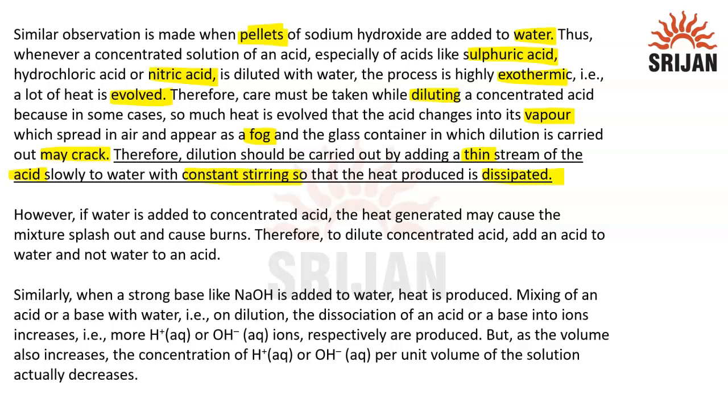We don't put water into the beaker of acid. We have to put acid into the beaker filled with water. This must be taken care of. If we add water directly to concentrated acid, a lot of heat is generated, which may cause splashing and burns. The beaker may even break, the acid will spread, and the person performing the experiment may get hurt. So care must be taken.